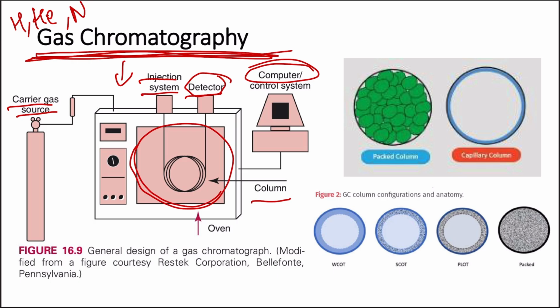And then we have the injection system where we are going to put the sample, and then without interrupting the gas flow, that is without interrupting the mobile phase flow, the samples are released. It can be given directly in the form of a liquid, which will be vaporized at the port, that is the port from where the components come out in the form of gas.